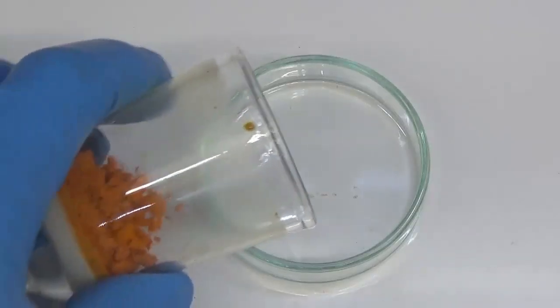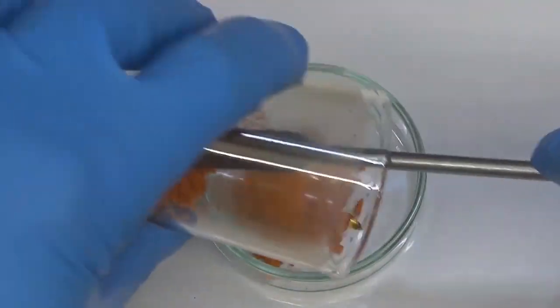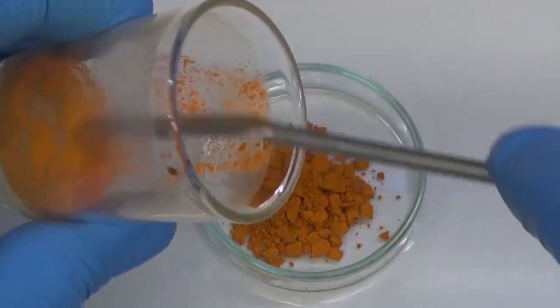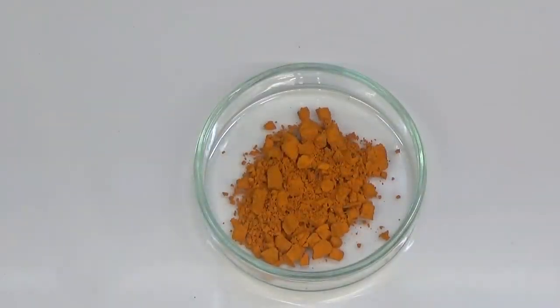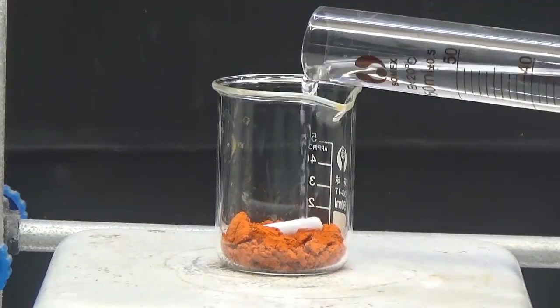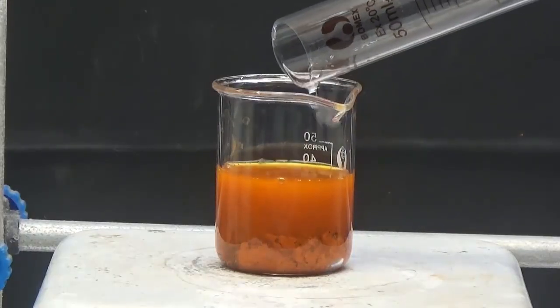The quantity of product obtained was 0.8 grams. The theoretical melting point for isatin is 196 to 198 degrees Celsius, and the actual melting point for our isatin was 152. For purifying isatin, it is crystallized with glacial acetic acid.